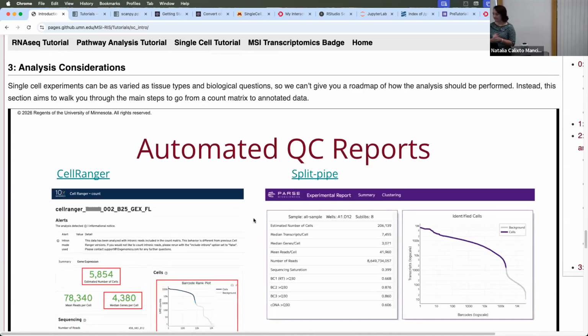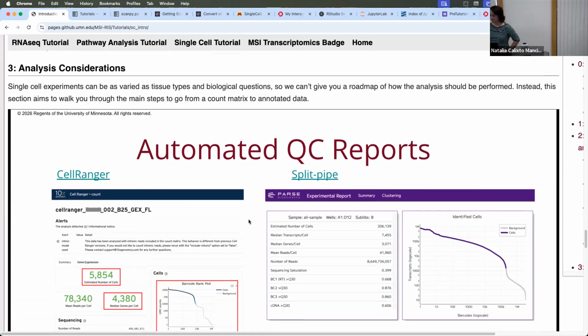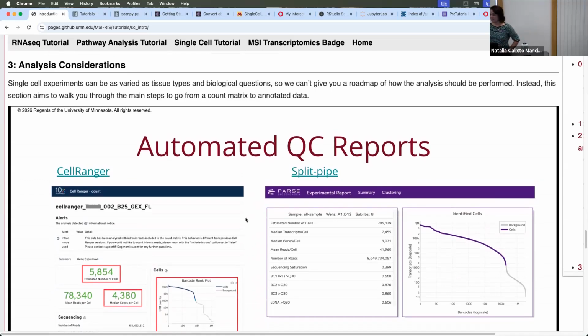I was wondering, where do the 0 cases that you should remove come from? Like, the gene is not expressed? No. So the 0, for example, cells that have a total count of 0. Yeah, and feature 0, right? Yes. So that case, that's a beautiful question because it leads us directly to the next part.